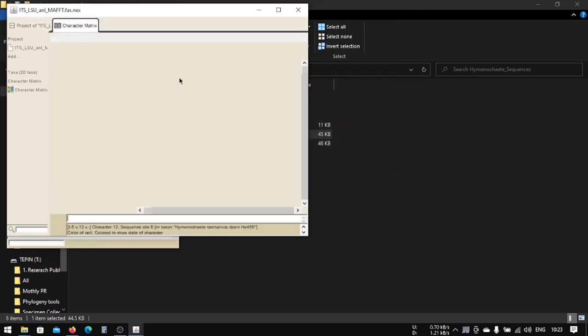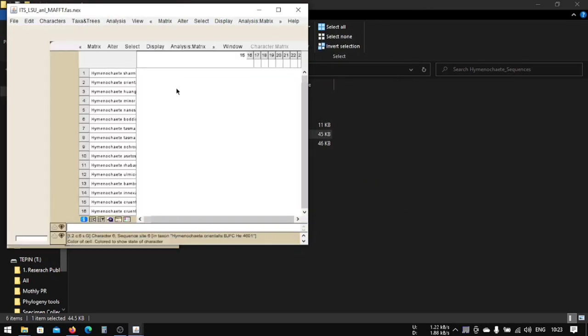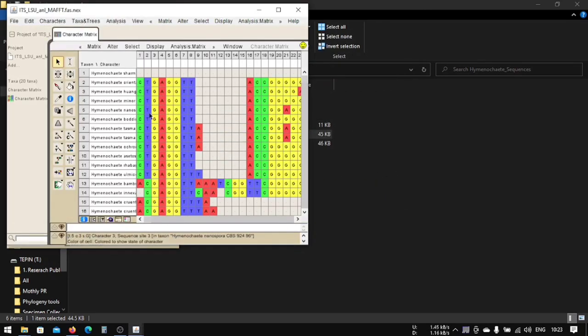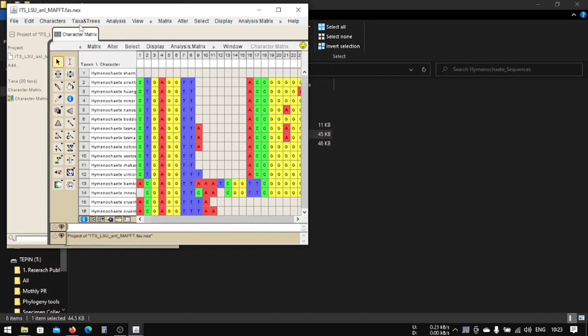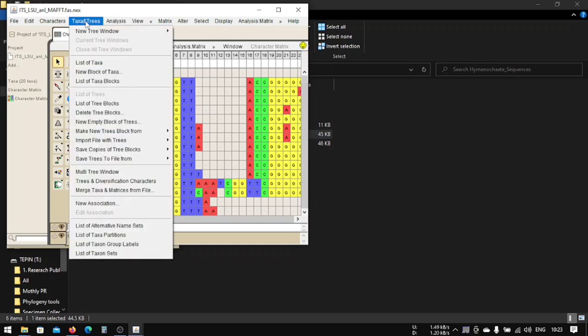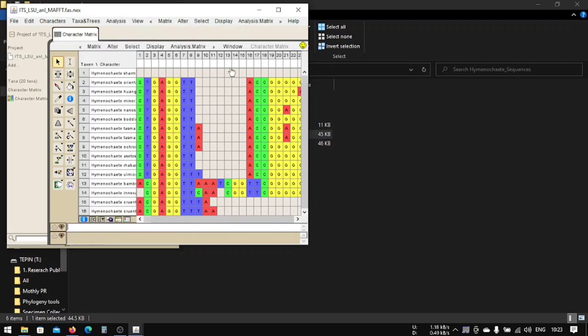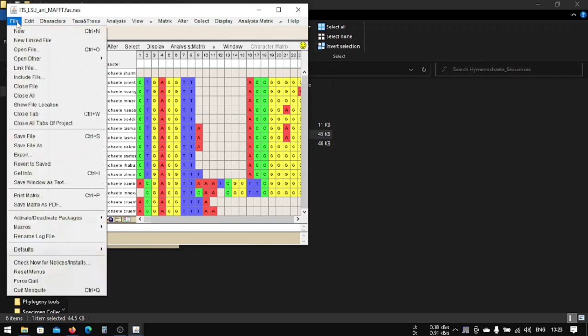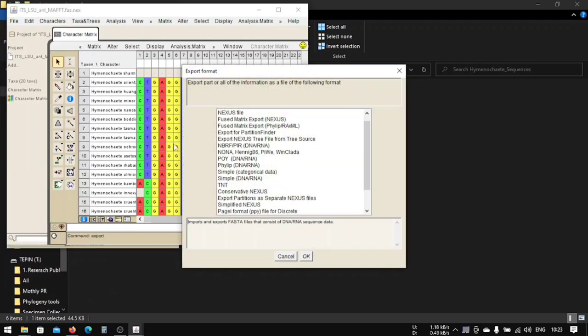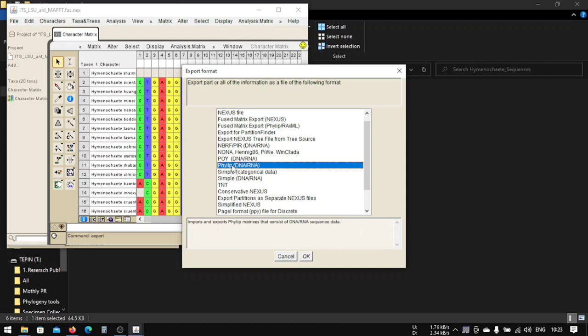It will open our file. Now after doing this, you can also do many other things like tree window here. There are very different options. This is also a phylogenetic tool which can be used for various analysis, but most people prefer it to export and change the extension from FASTA to phylip.